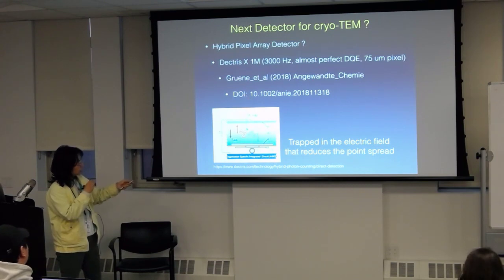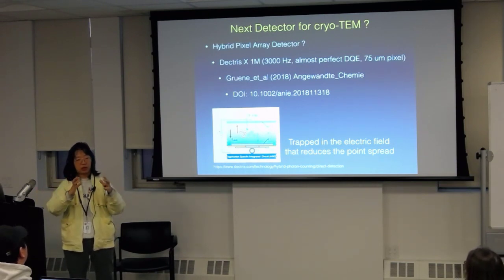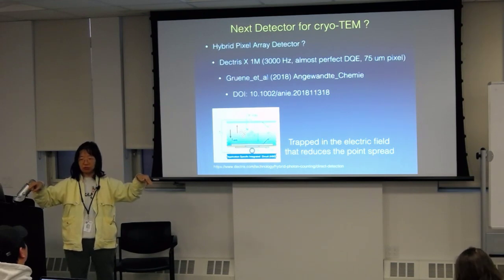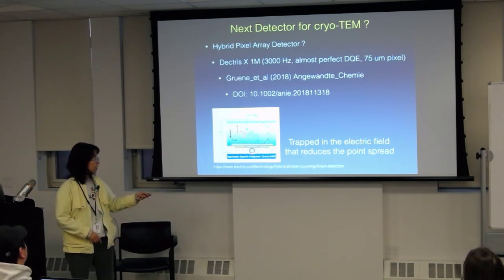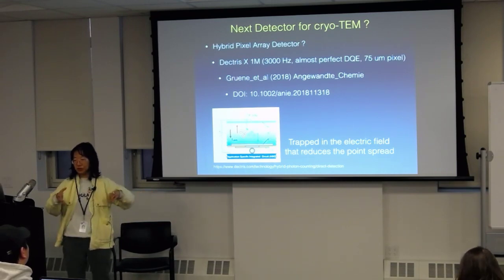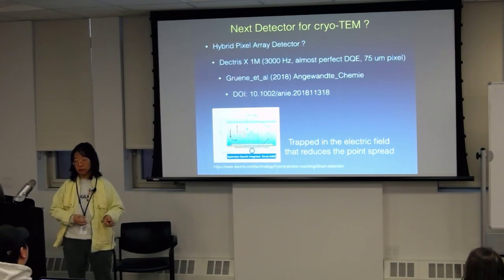So when something comes in, it's basically concentrated back. It cannot spread out. It gets restricted into that area. So each pixel, when you get a hit in this pixel, it's not going to get to the neighboring pixels. It always gets where you are. So that makes it a perfect detector. And then, just like CMOS, each pixel individually has the capacity to transfer that into a real signal. So that makes this a really good detector.